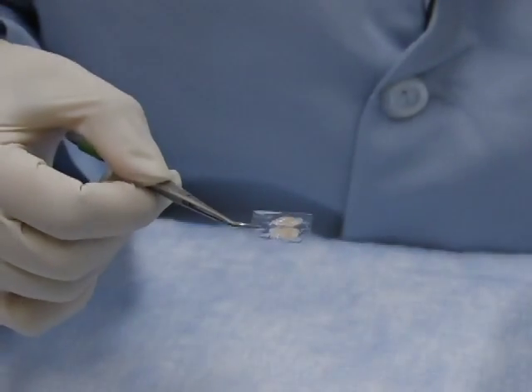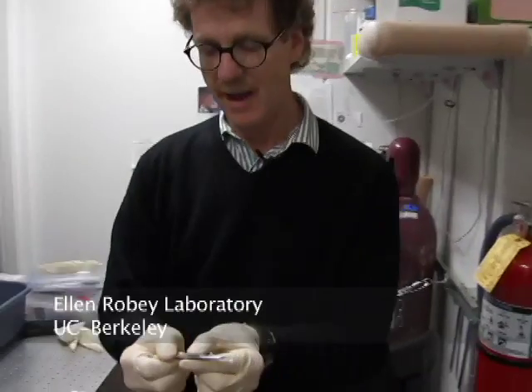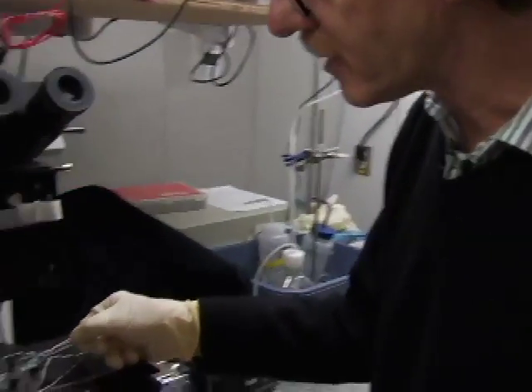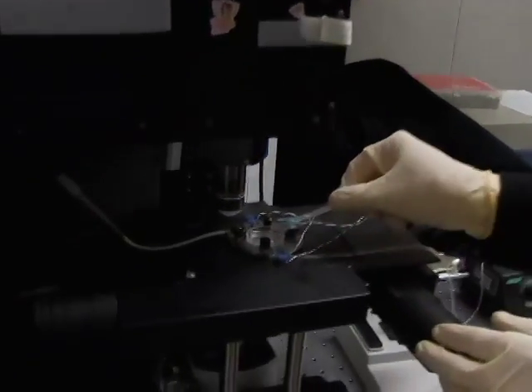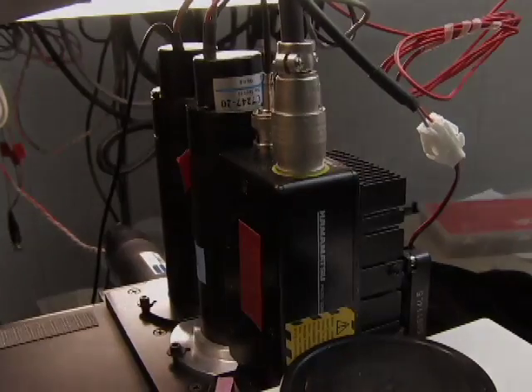Now that we've attached both thymic globes to the cover slip, we're going to pass it off to Paul for imaging. Let's take this sample and put it in the DME medium that we're going to use to image it.